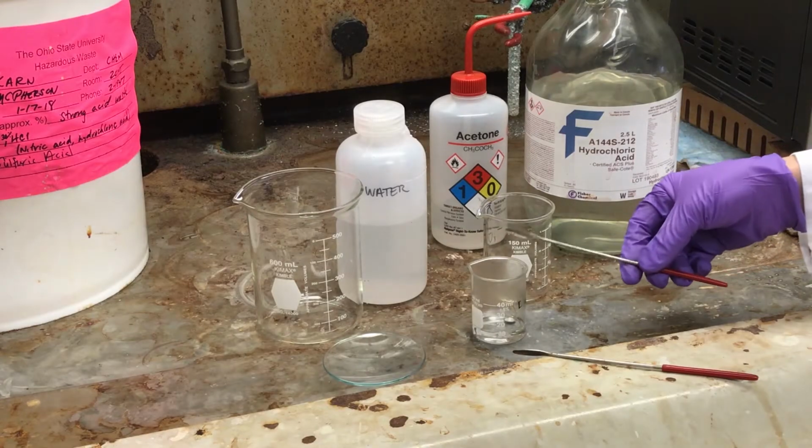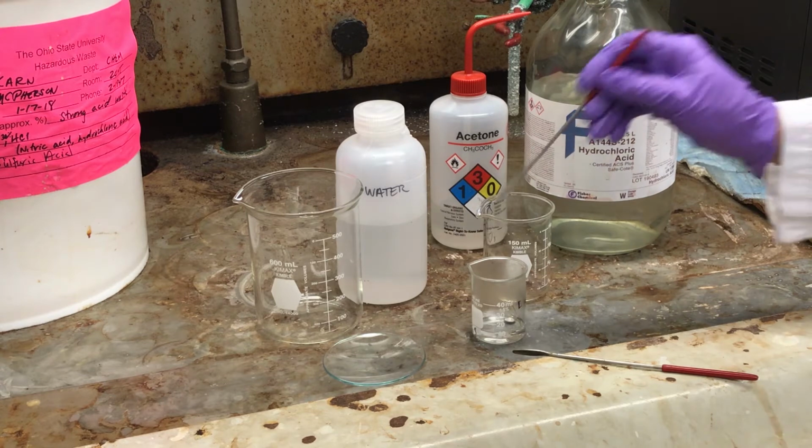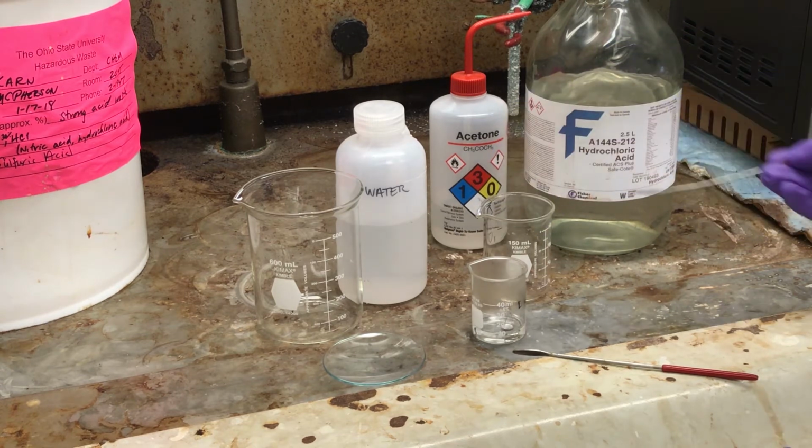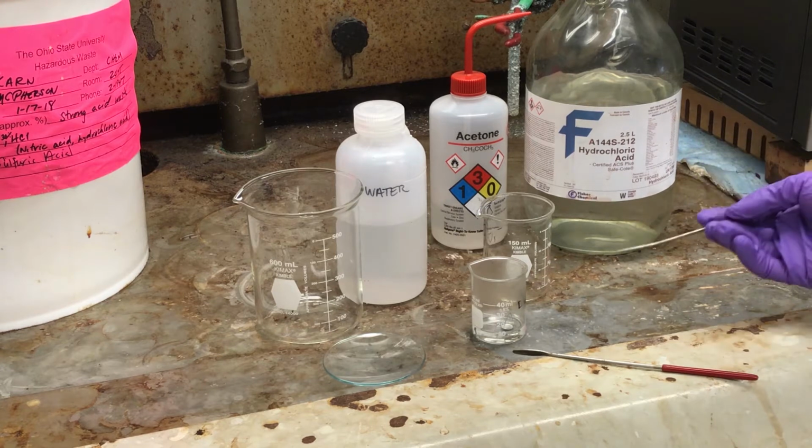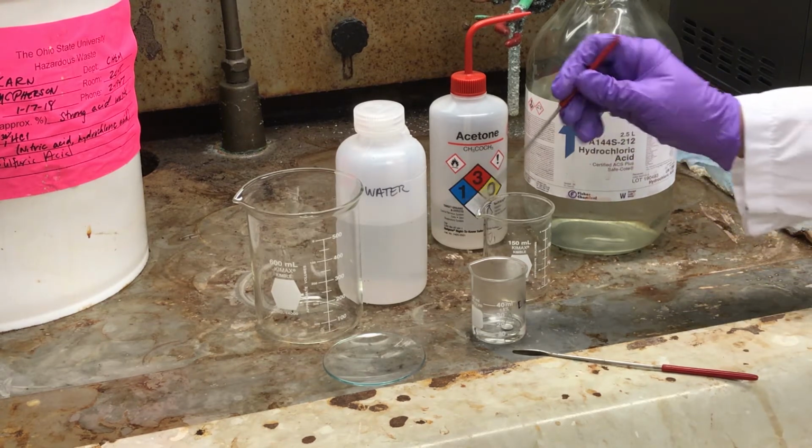Please only use the spatulas when you're manipulating the platinum pan in the hydrochloric acid. These are chemical resistant. Things like the forceps are not, and so they can become damaged easily.